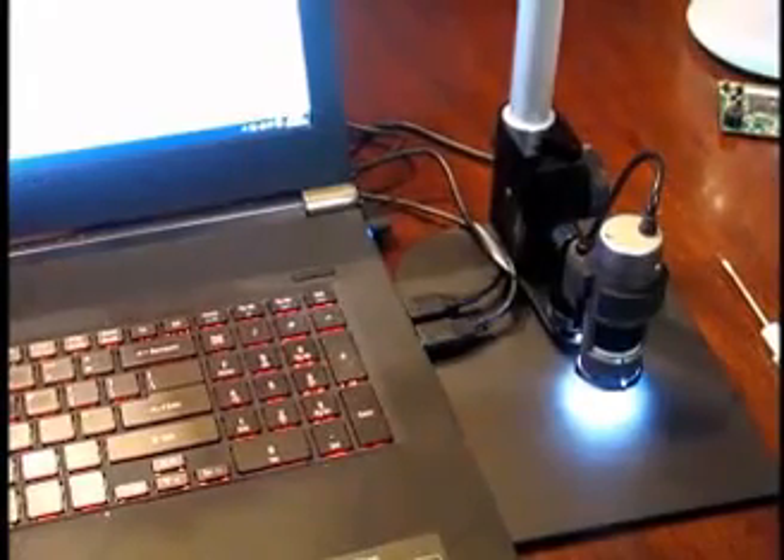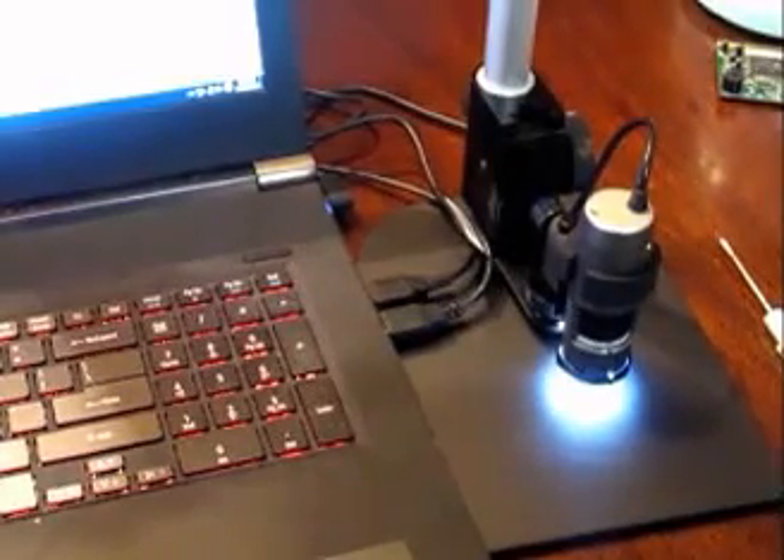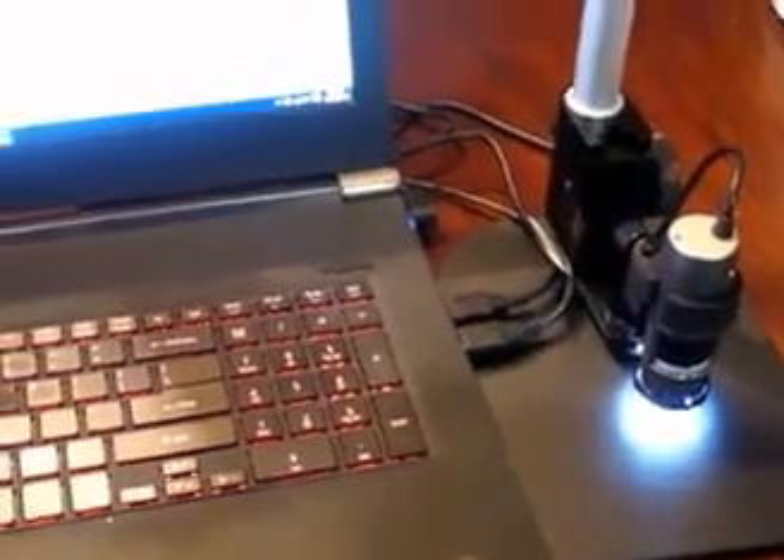We've got the microscope hooked up running into my laptop. Right now in the field of view we have a dime — 10 cents — and we're going to look at it at about 100 power. I'm going to bring my screen into focus and there you can see part of the date. Underneath the bust you can see the letters 'JS,' which a lot of people probably never noticed — that's actually the initials of the designer of the 10-cent piece.